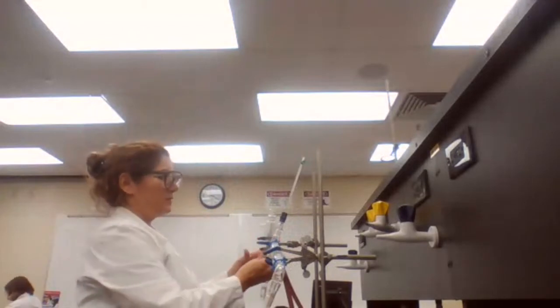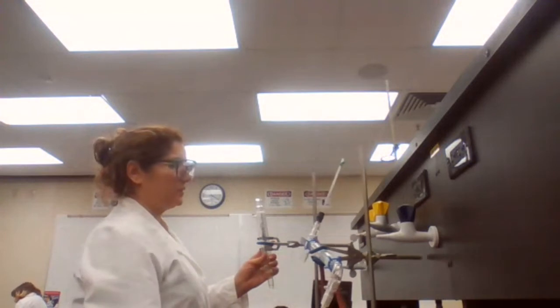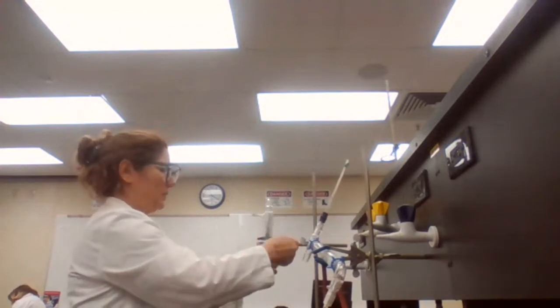Hold the condenser. Push this back so you can see what I'm doing here.